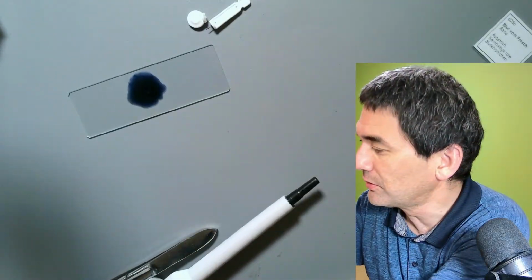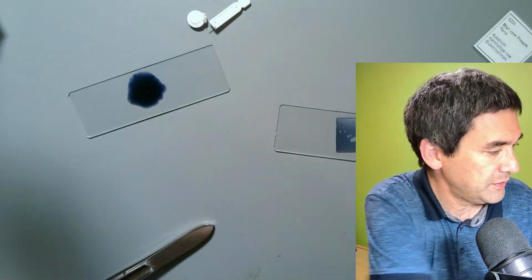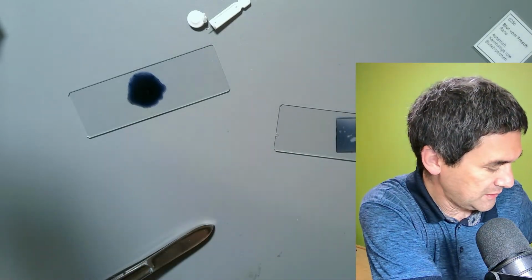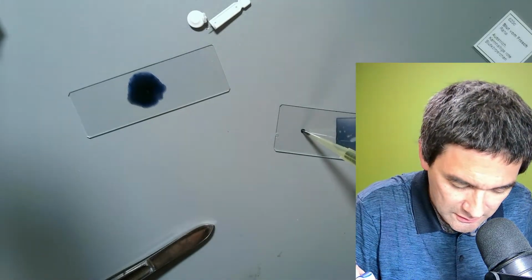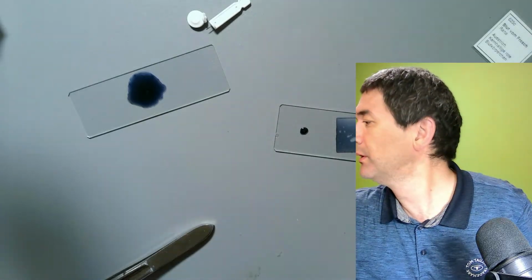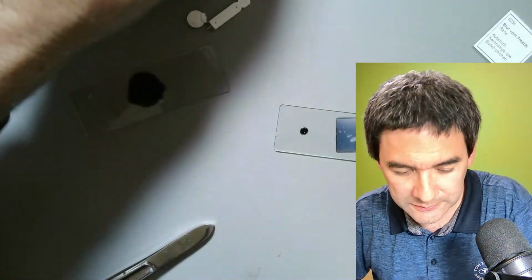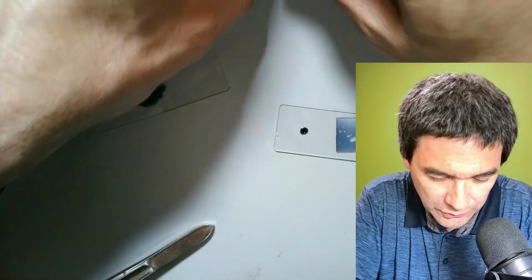Okay, so I'm going to take this away here. I'm going to still have plenty of this here in any case. So let's give it another try. Let's take a very small drop now. Unfortunately, this cover glass was broken.